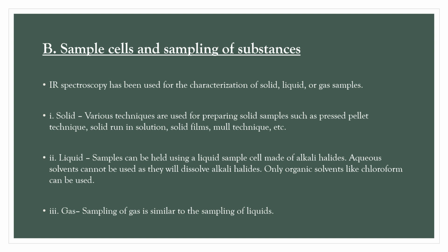Sample cells and sampling of substances. Infrared spectroscopy has been used for the characterization of solid, liquid, or gas samples. Solid. Various techniques are used for preparing solid samples such as pressed pellet technique, solid run in solution, solid films, mull technique, etc. Liquid.